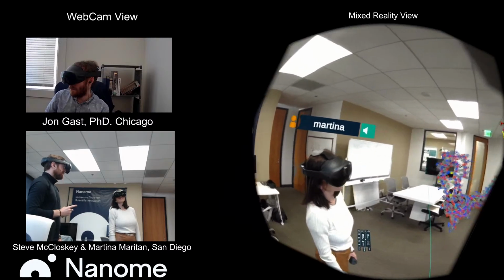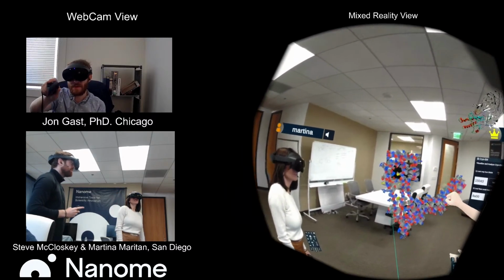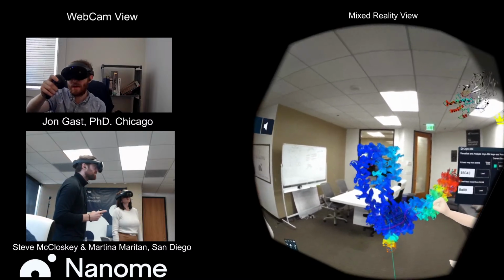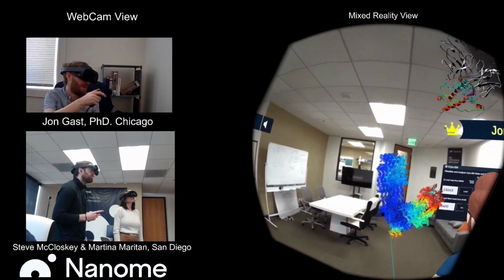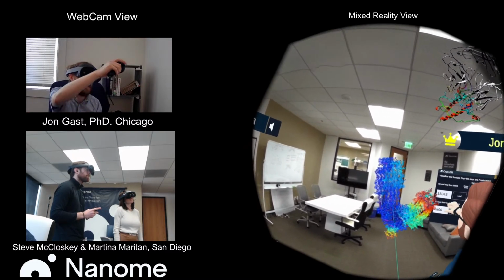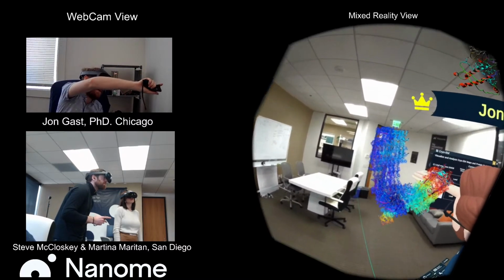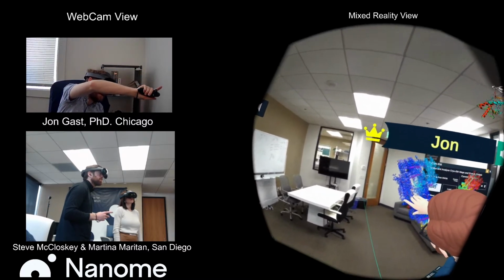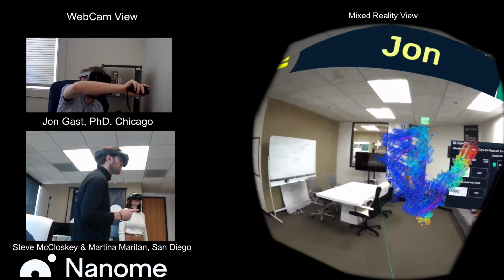Oh, sorry, John. I was just going to say, let's provide a bit of an example of that here, of looking at the map. I'll reduce the opacity a little bit more. If we look at the map with the B factor data represented at the same time, we can even see the amount of area. Like this methionine, it's fitting into this map very, very neatly, very closely.